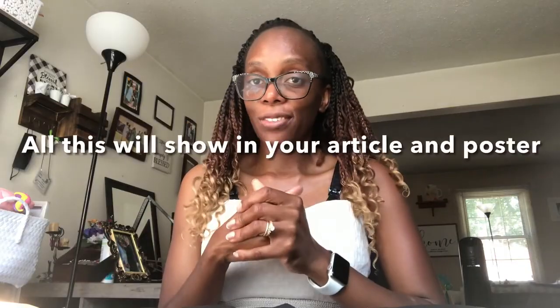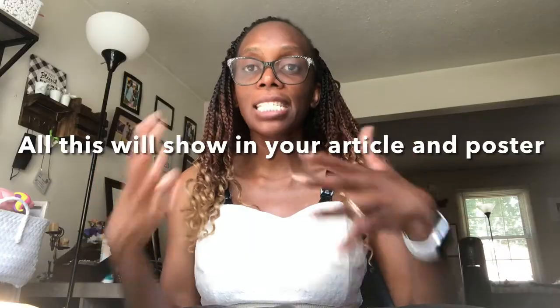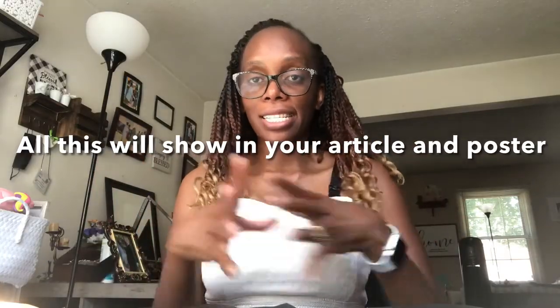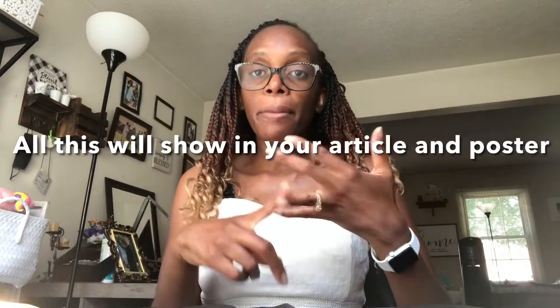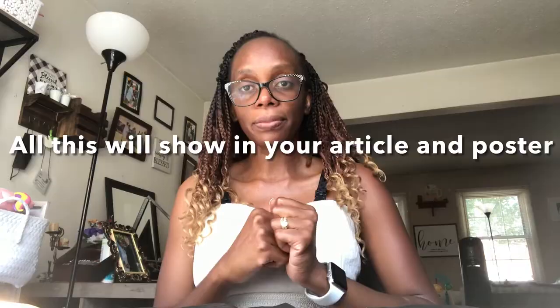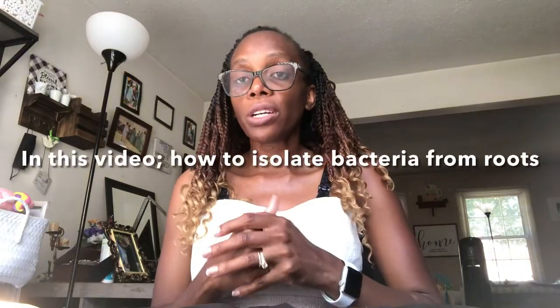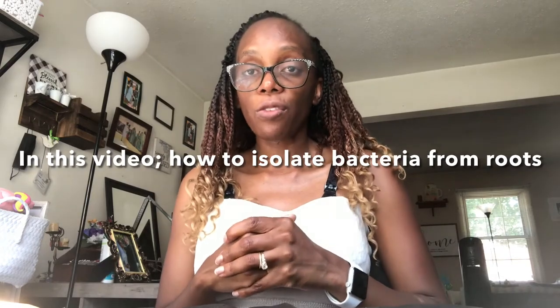I'm very excited to see that, and to really learn, because we're all learning what's actually happening in your own city and state when it comes to the microbiology, the plant microbe interactions, and the bioinformatics tools that we're going to use. Okay, so in this video I'm going to demonstrate how to isolate bacteria from roots.